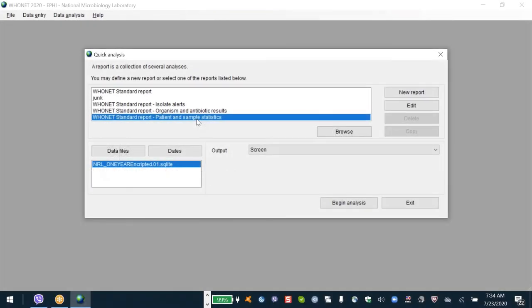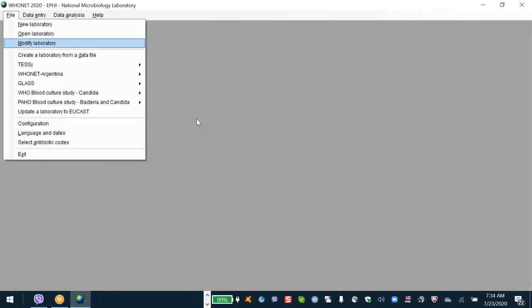One thing we discussed was the idea of a national configuration so that you could analyze the data from all the hospitals at once. So I'll just repeat that because I believe I did cover it last time. As I said, a lot of times if you have 10 labs, they have identical configurations because very often you create one for hospital one and then people just copy it multiple times. If you do that, then you have 10 identical copies, in which case it doesn't matter which configuration you use because they're all the same. But of course, over time, the different configurations often develop a life of their own.